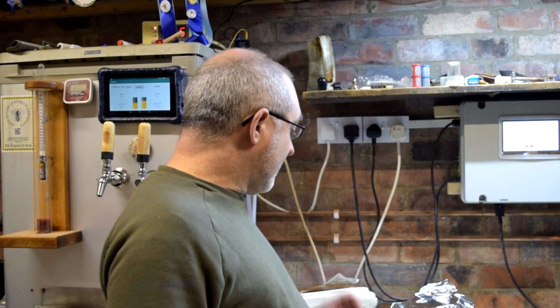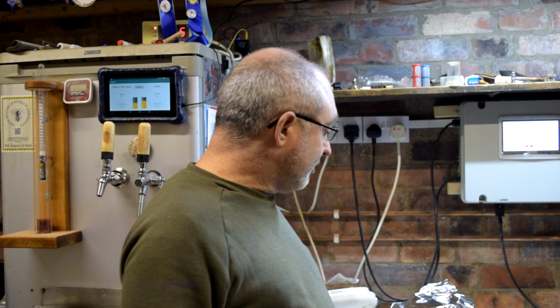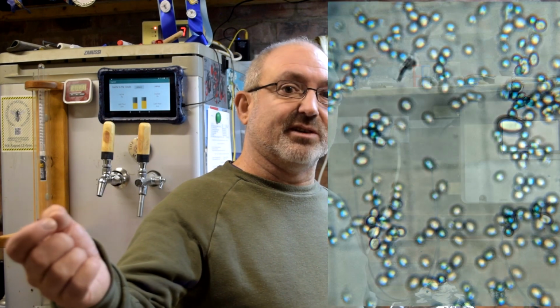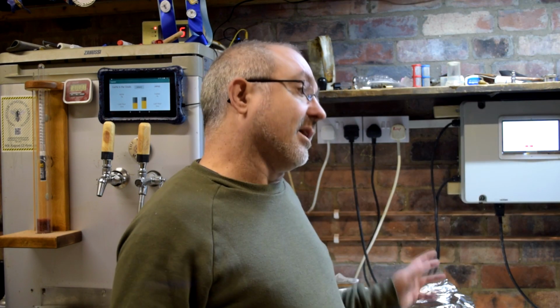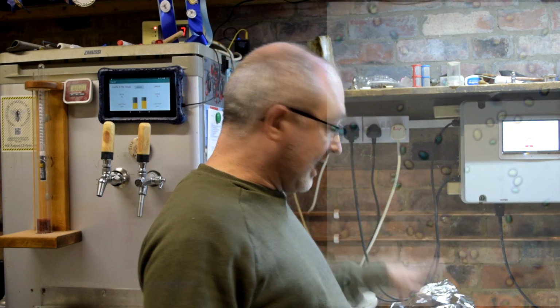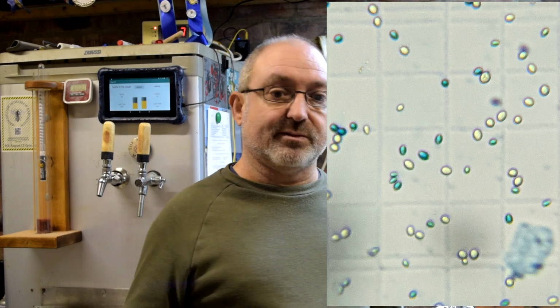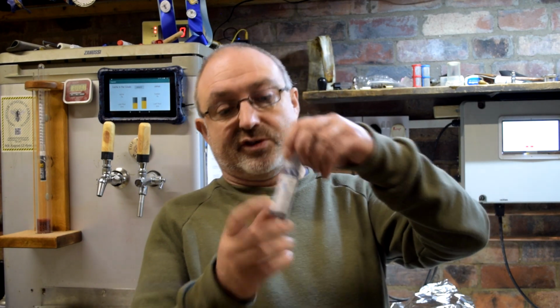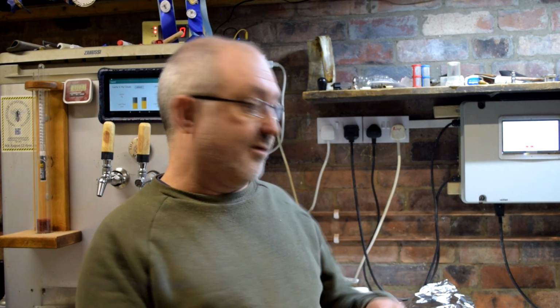After it had finished rehydrating, I took off a couple of samples, 2 millilitres into 2 different glasses, just to give myself a backup in case I did something wrong. With the first 2 millilitres, I diluted it 30 times. I started off by diluting it 10 times. As you can see in this picture, there were far too many cells to count accurately. So I diluted it another 3 times to make it up to 30 times in total. And then we get a cell looking like this. After diluting, I added a drop of methylene blue dye. This is supposed to show you which cells are viable and which cells aren't.